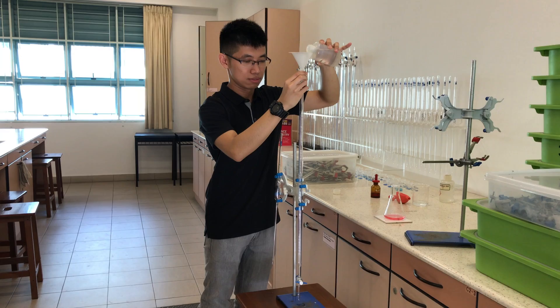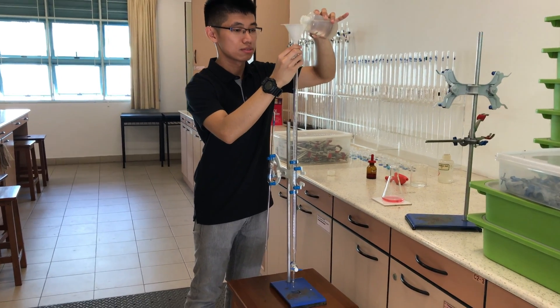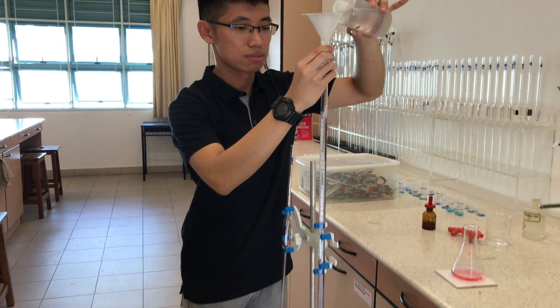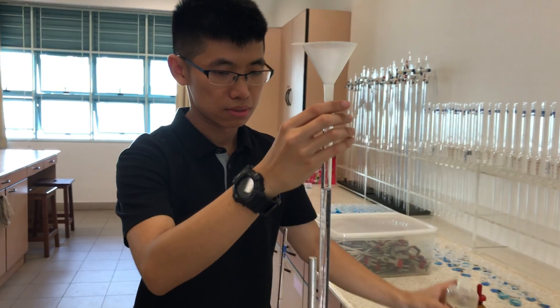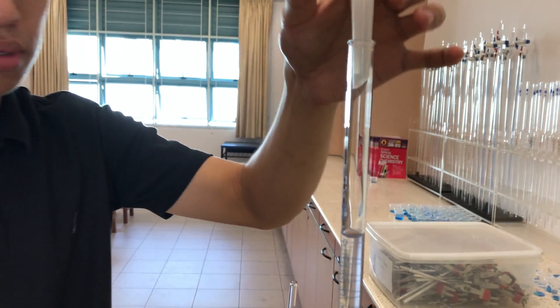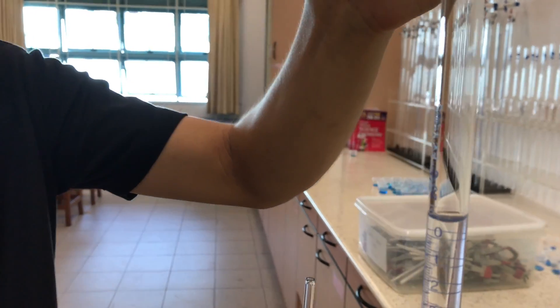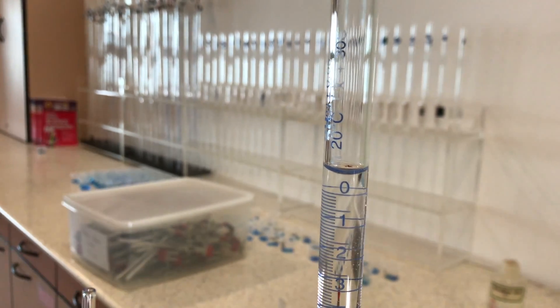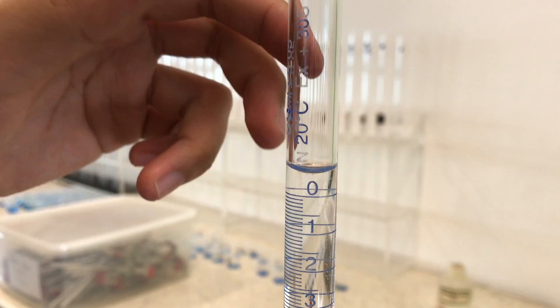Once you have filled the burette, remember to remove the filter funnel from the top to prevent any residual liquid from dripping down. We can fill a little bit more past the zero mark and then move over to the sink to adjust the liquid level to zero.